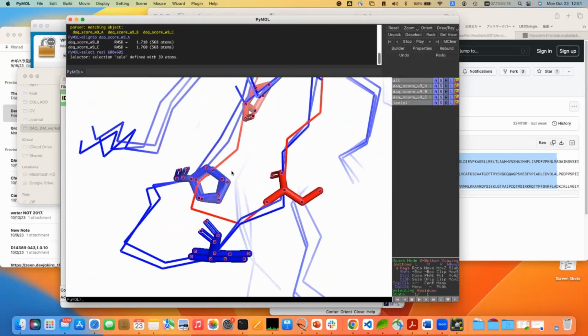Yeah, this is very interesting. Both chain A and C have almost identical structure, but at this position only chain B has a different sequence assignment. Residue number 600 is modeled here, then 605 is modeled here. Yeah, a sequence shift happens.